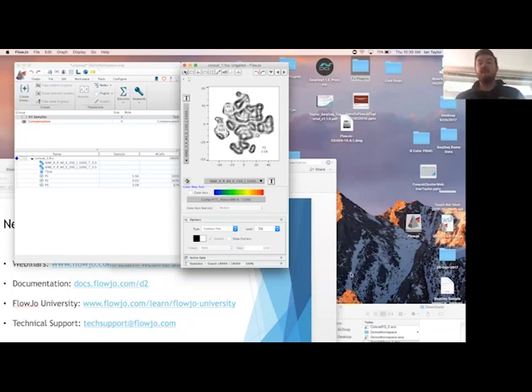Good question. If you wanted fewer clusters, I would suggest reducing the iterations, and vice versa. If you wanted more clusters, you could increase the iterations. The perplexity is the other parameter I would probably suggest altering next. You do have other options like the learning rate and the theta, which you could adjust, but that's going to be much more fine-tuning of the t-SNE mapping that you get.